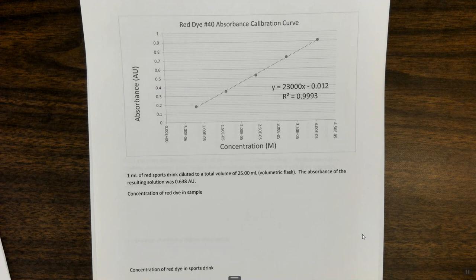Now, in experiment 2, we went over the theory of absorbance, why molecules absorb light and things like that. You might want to review that, if you don't remember, because it'll help you write your pre-lab. Included in there is things like Beer's Law, and also included in the experiment 2 video is how to blank the spectrophotometer. So that is basically what we're looking at.